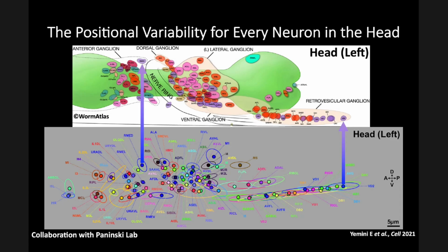Let's see. So you touched on this one a little bit, but I'll go ahead and ask it because I think it's something interesting to expound on. Would this technique work in animals that aren't very flat? So like you have cells at different depths that might be different shades of the same color. Would that start to muddle your IDs? That's a great question.